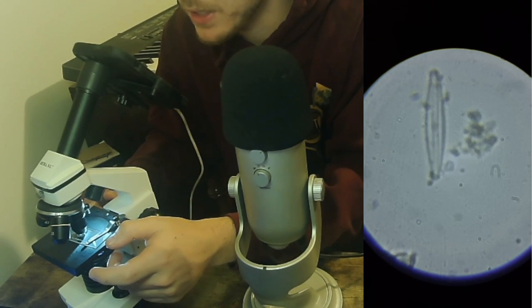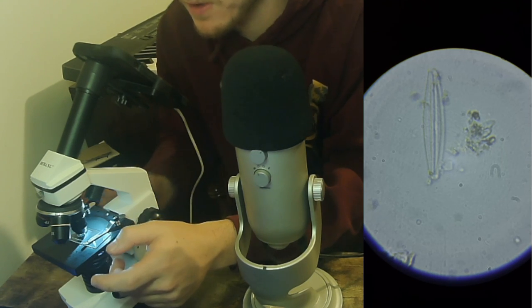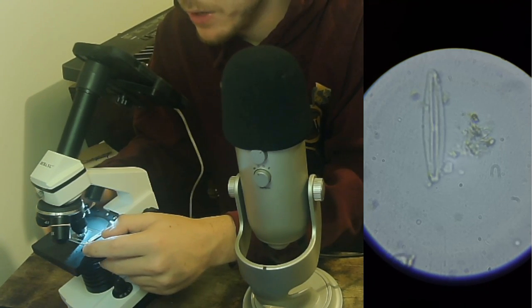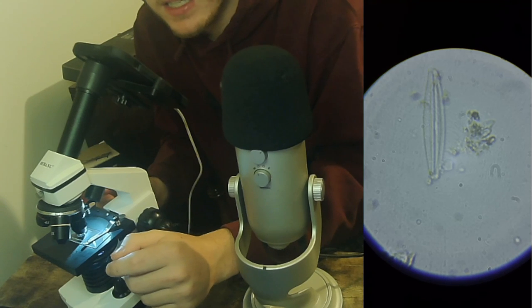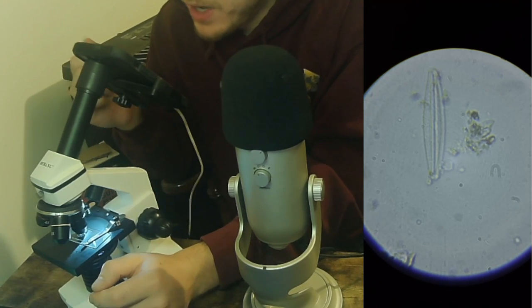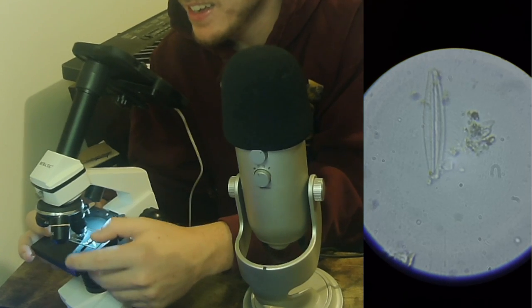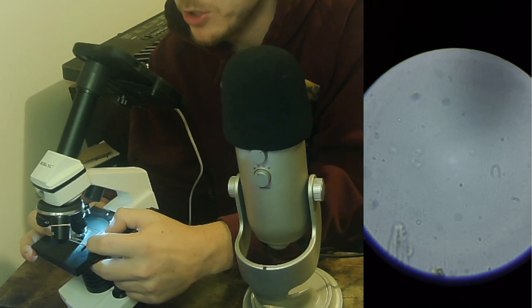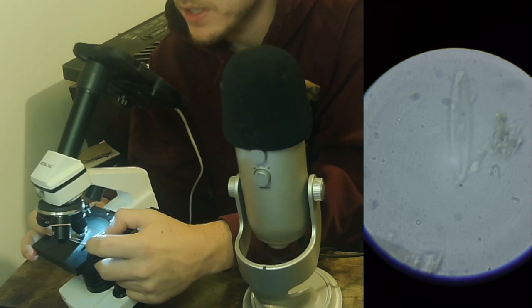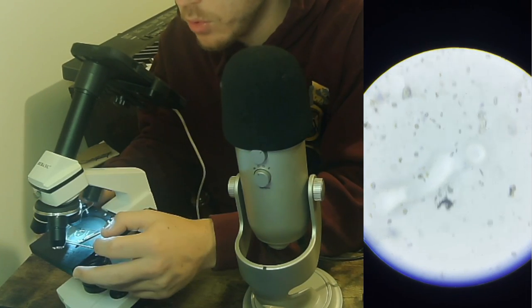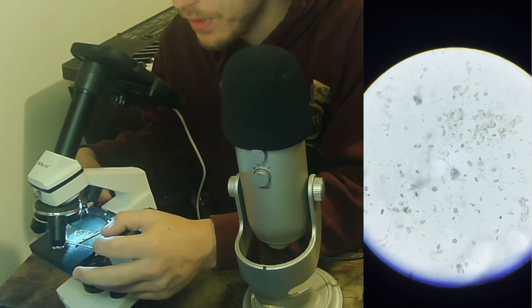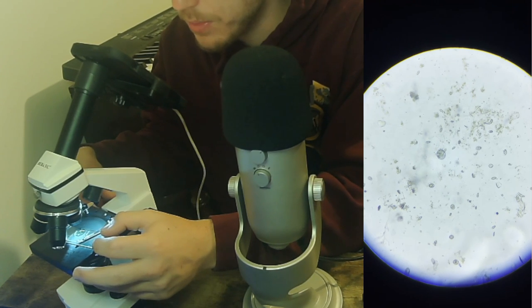This is definitely a diatom of some sort. Diatoms I believe are algae. This little pointy guy that I don't even know how to describe his shape, maybe like a straight banana, this is a common shape. These are diatoms.